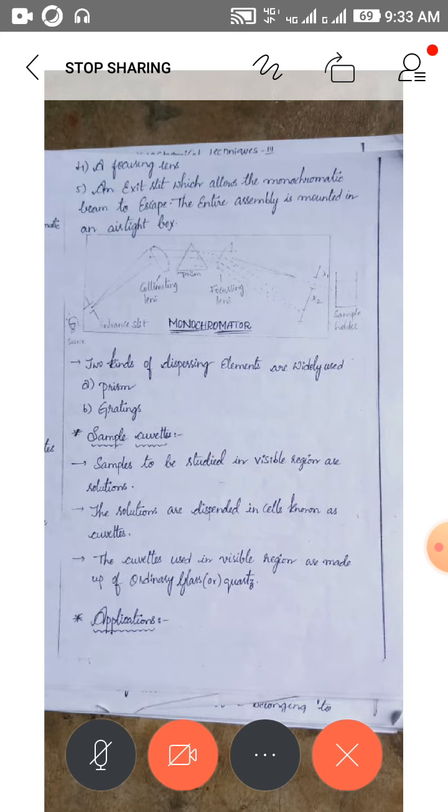Two kinds of dispersing elements are widely used. The first one is the prism and the second one is gratings. Here sample cuvettes are also used. Samples to be studied in the visible region are solutions, and the solutions are dissolved in cells known as cuvettes. The cuvettes used in the visible region are made up of ordinary glass or quartz.